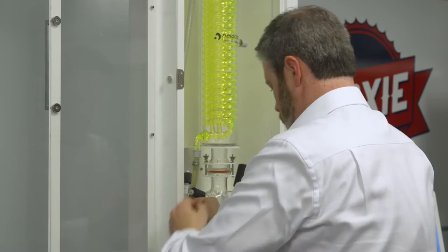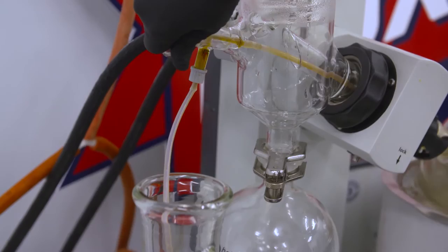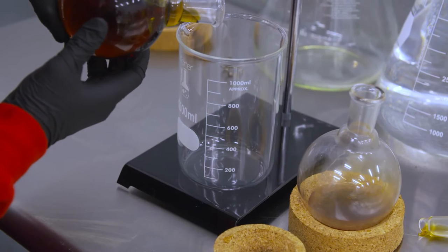All of our products are supported by our North American team that provides installation, training, and application support. Forming the ideal basis for intelligent evaporation, the HIVAP series is suitable for standard distillation, complex distilling processes, and automatic distillation.